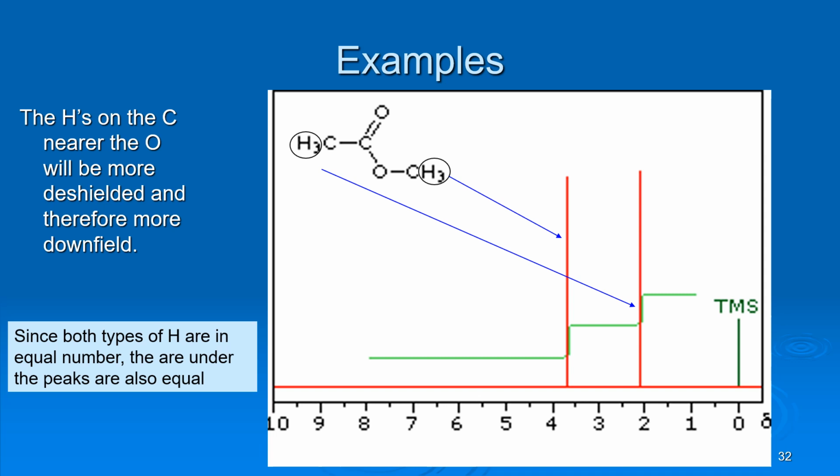All right, so again, this is just repeating. If you were reading my slides without me, this would be describing what I just said. So again, the hydrogens on the carbon next to the carbonyl will be slightly more shielded. The one attached to the oxygen will be further to the left. And after a while, you start to get used to, you know, if the hydrogen is attached to a carbon attached to an oxygen, it tends to be right around 4, something like that.